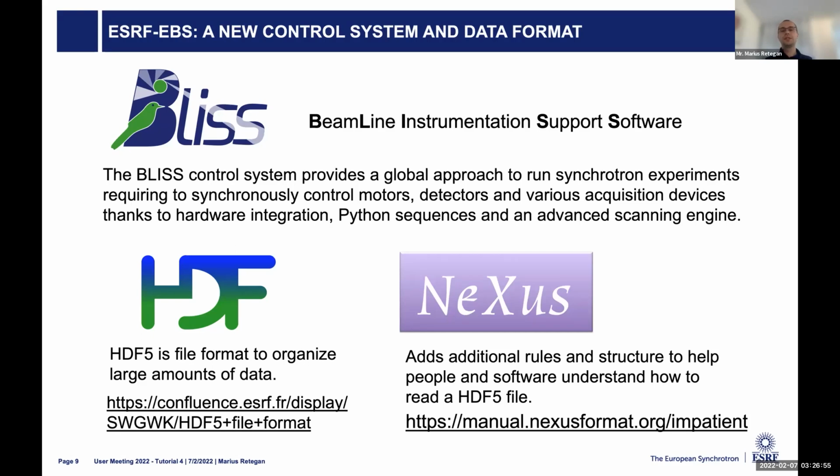Now, I assume because you're here, most of you did spectroscopy experiments, and in these experiments, you know that even the spec files were ASCII files. So if you would open them with a text editor, you could see exactly what's inside them. With HDF5, these are binary files.